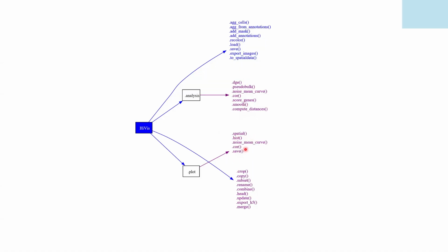And every plot is simply just saved. Every plot here is one line of code, very easy. It has tons of cosmetic arguments inside, which you can check out in the documentation. And also, all of those return an ax object which you can further modify by matplotlib functions.